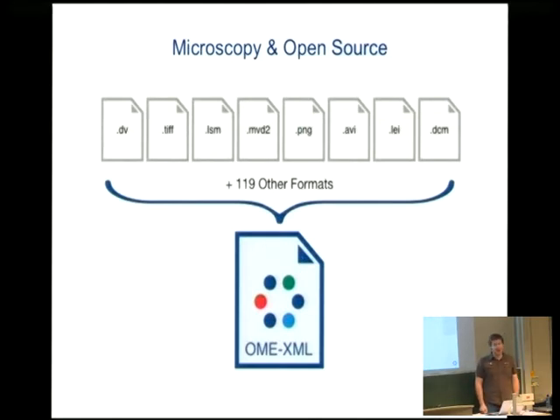So as Blazej said, the microscopy world is really proprietary. All the instruments being built, they cost like hundreds of thousands of pounds in some cases. So they've obviously invested a lot of money in it and would like to lock you in as much as possible. So what generally happens is they've written some specific acquisition software which comes with their instrument, and then it outputs a specific format. So you're already locked into Delta Vision or some Zeiss format for whatever microscope it is that you've got.